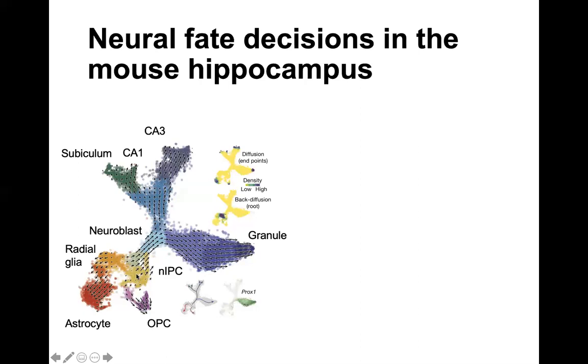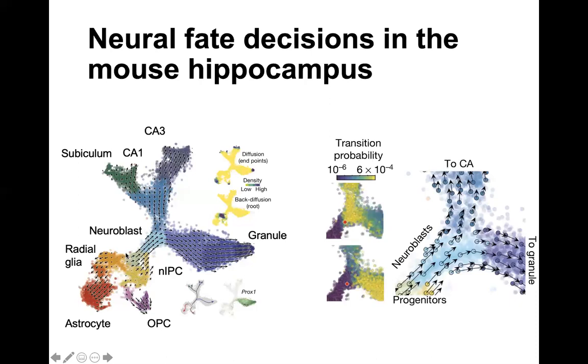So not only does diffusion pseudotime suggest that these are the ends, but also the rates of transcription and degradation give you this idea. What's really cool is we can imagine having 2 points in this data set. These are 2 different cells. They're very close together transcriptionally. But if you look at their transition probability based off of RNA velocity to other cells in the data set, this cell looks like it's going to go towards this upper branch of the data set.